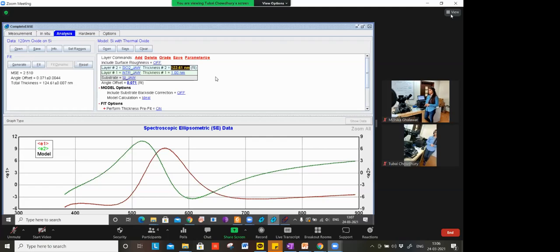Hello. Yeah. Hi, Monica. Actually, I lost my network. Can you repeat your question? My question is, what is it that you want for one example in CompleteEASE? I am not getting what you want to know. No, I just said I just wanted to see the tungsten fitting. That's it.